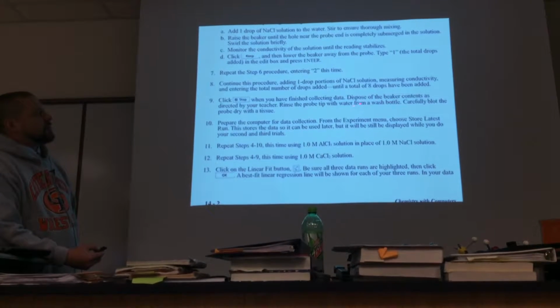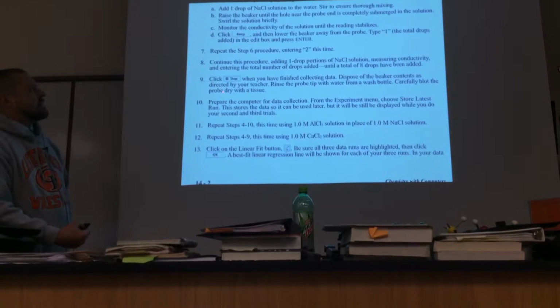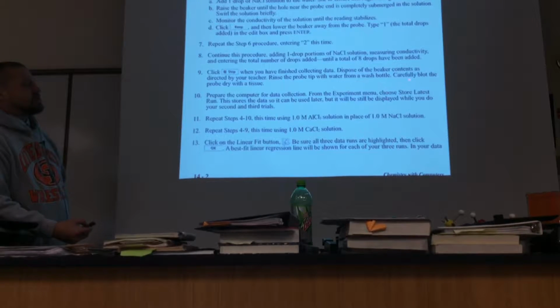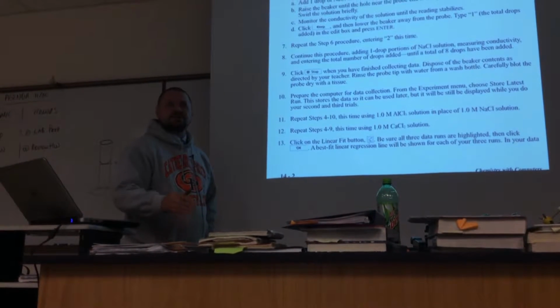You got to rinse the probe with water, follow that direction, dry off the probe. Okay, that's fine. This step right here: Prepare the computer for data collection. From the experiment menu, choose Store Latest Run. If you don't do that, you lose all your data. All right, read your directions.